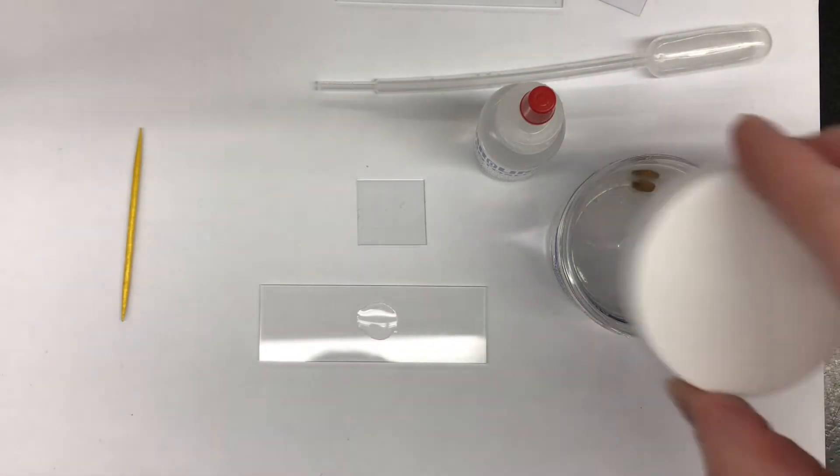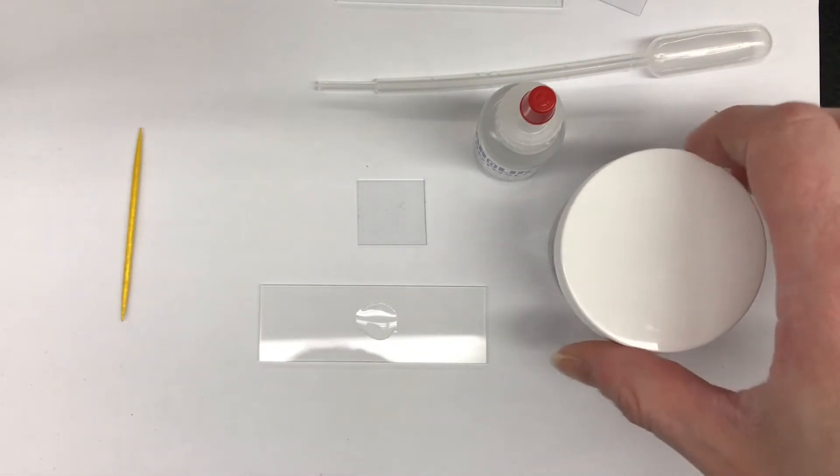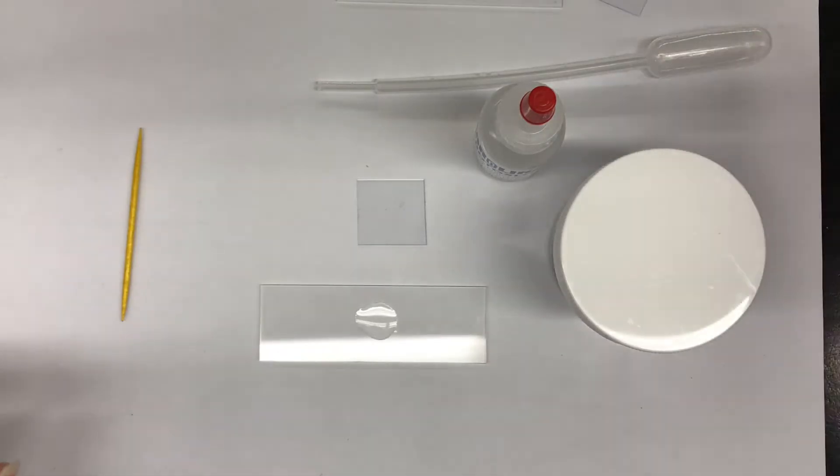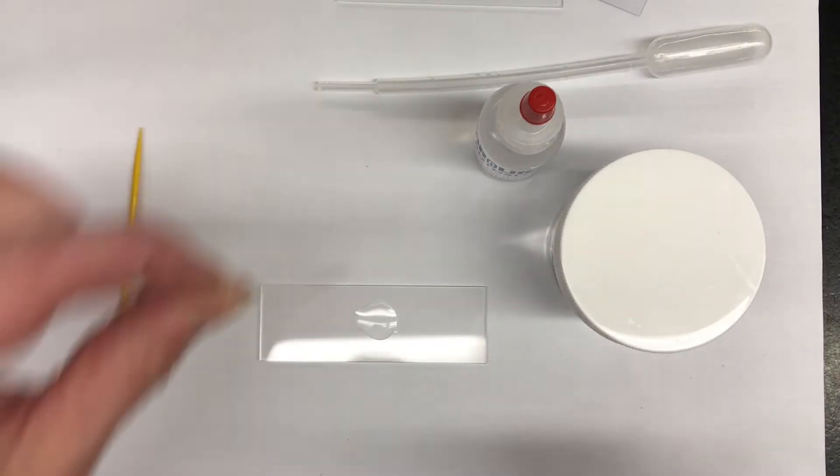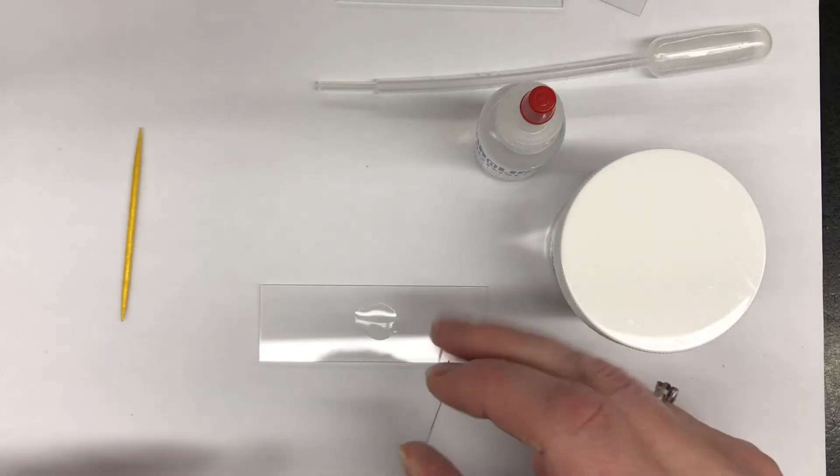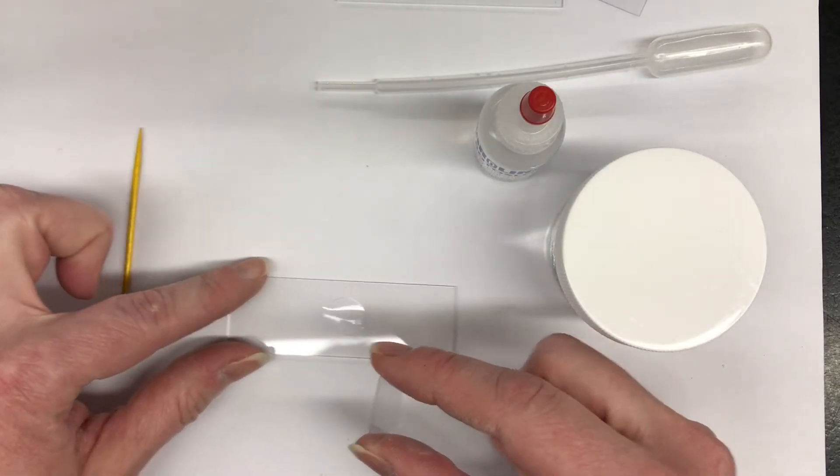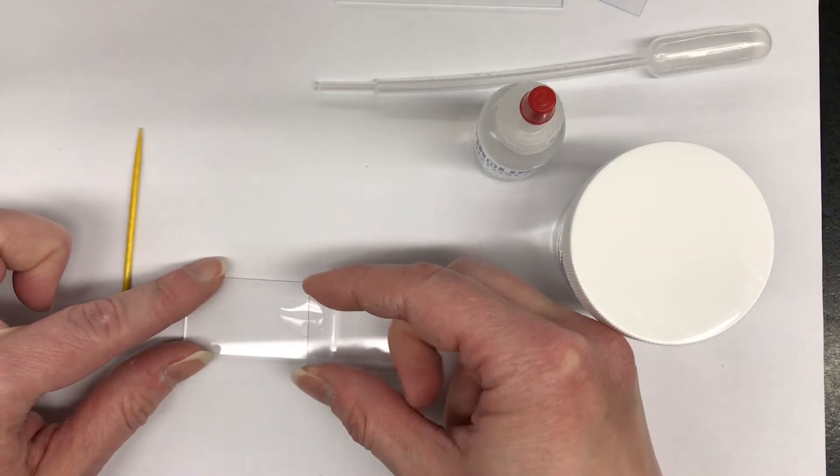You're going to take the jar lid and place it back on your specimen. Pick up your cover slip.